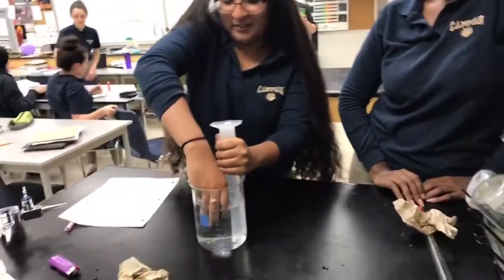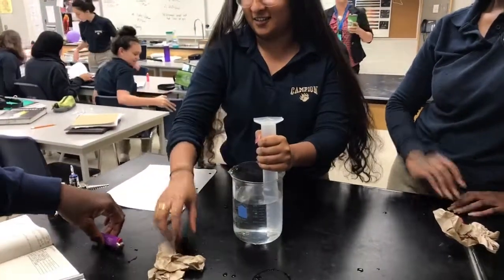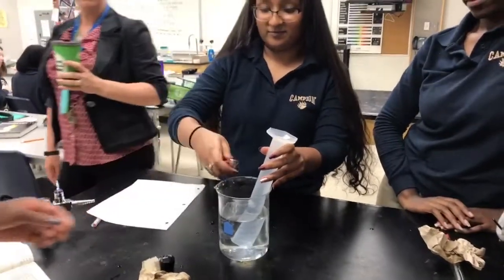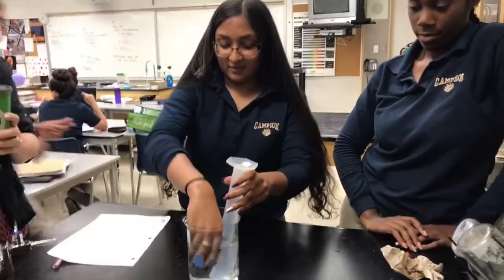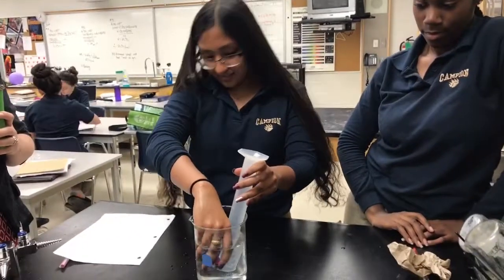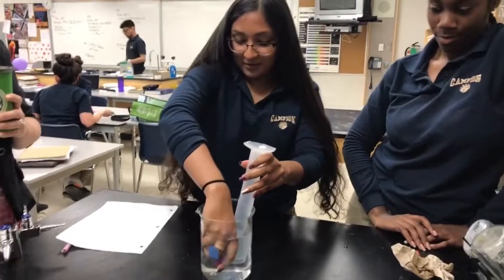And now the next step is place the lighter under the open end of the graduated cylinder and depress the lighter to release the butane. Here we go. Who's going to do that? Here we go, Manisha. You got this. Let's see those air bubbles.